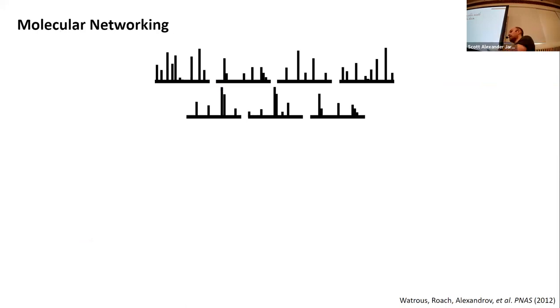Today, we're mainly using the MS2 spectra to annotate what these features are. We've mentioned it a couple of times already, but we want to reiterate it so this is completely clear. We look at these MS2 spectra and structure them by their spectral similarity.